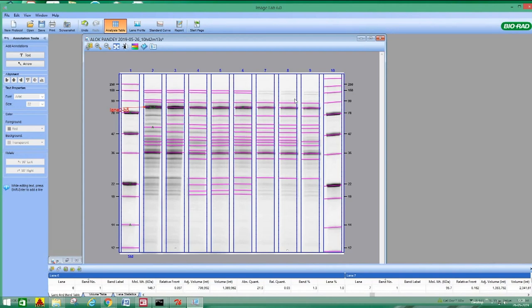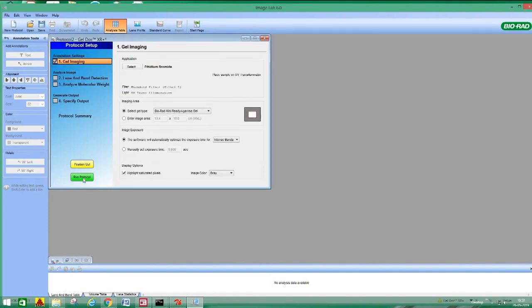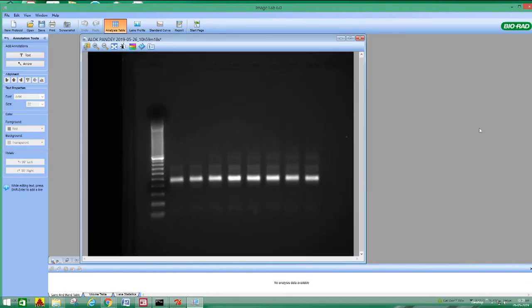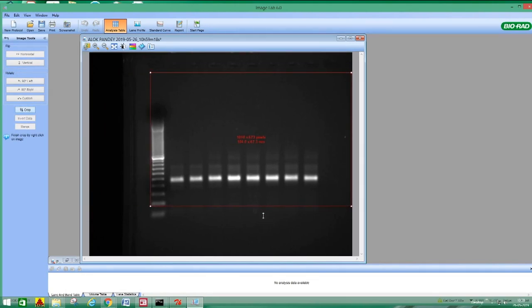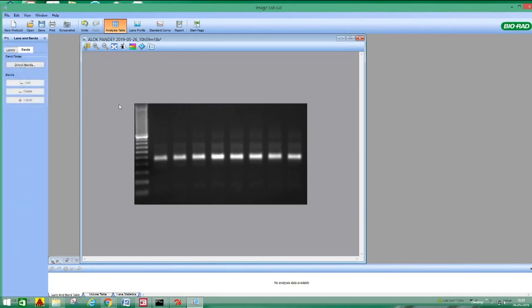Okay, so this is the way how the analysis can be done using ImageLab software. So this is all about proteins. So now I want to do the same analysis for the nucleic acids, suppose DNA. So now you have DNA. So all the part is same as compared to proteins. So you can go to image tools for cropping, you can crop it, or whatever the part you want to keep, you can keep that one and say crop. After that, lanes and bands.